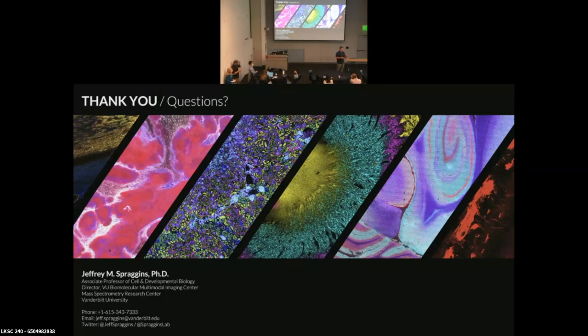What I will say is it depends on the instrument how many proteins you detect. If you're using a linear time of flight system, which is more traditional for proteins, it's tens of proteins. If you're using an FTICR or a QTOF like this, now you're talking about hundreds of proteins. So it just depends on how much resolving power and performance you have.